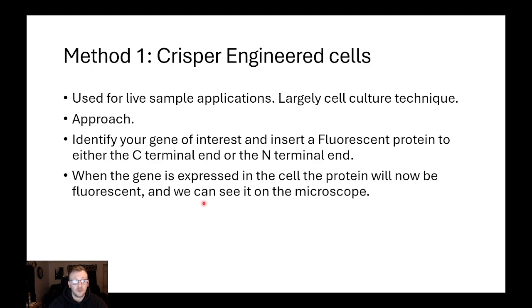Are things active all the time? Are they silenced? Are they upregulated, downregulated? One of the best ways you can do that is by just looking at the cell and seeing when things fluoresce.